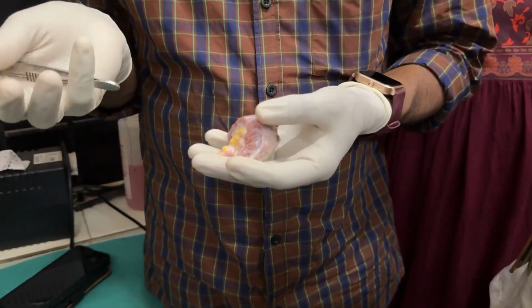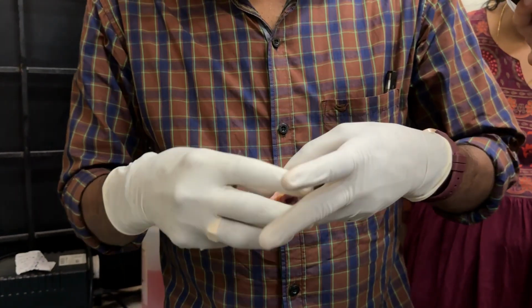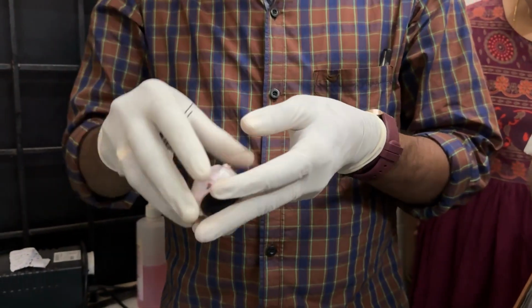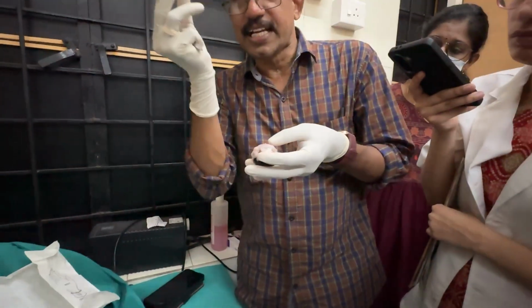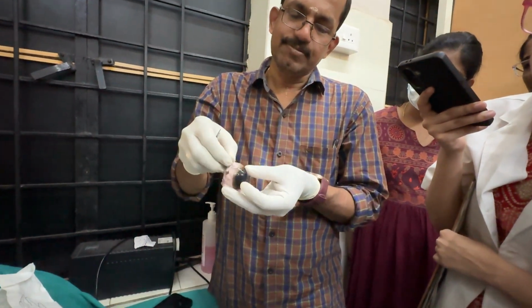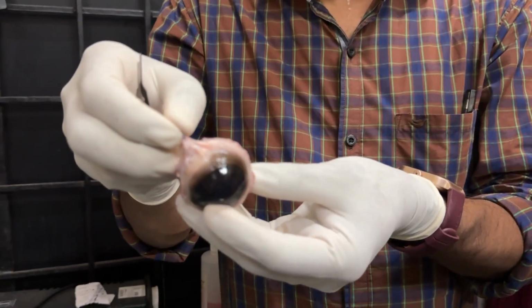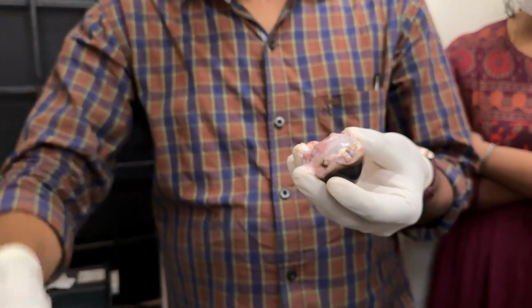So the eyeball is actually seated like this. The optic nerve will always be on the medial side. Like that we will see the direction. Inferiorly and medially is the optic nerve. The eyeball is like this, and we can see the optic disc is like that. So this is always a right eye. Like that we will identify the side. It's a right eye. You can see the optic nerve inferiorly and medially. If it is the left eye, it is just the opposite.